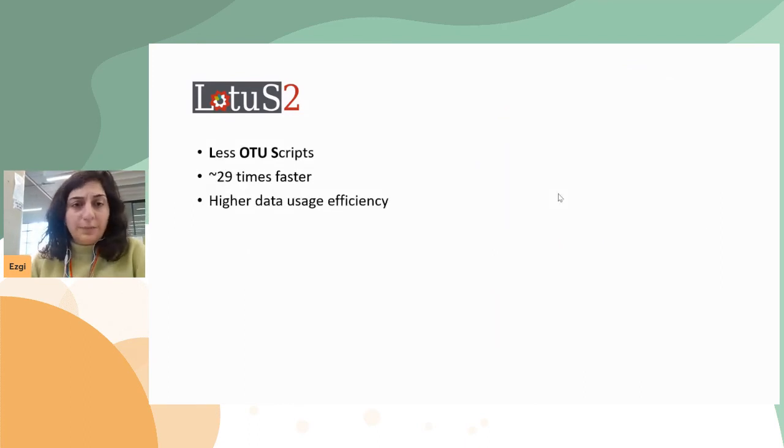The aim of a pipeline should be to incorporate as many reads as possible in the final output matrix, because if the user is investing money into sequencing, of course they would like to use as much of the data as possible. However, this should be carefully balanced by filtering of technical artifacts, which can otherwise inflate the biodiversity.